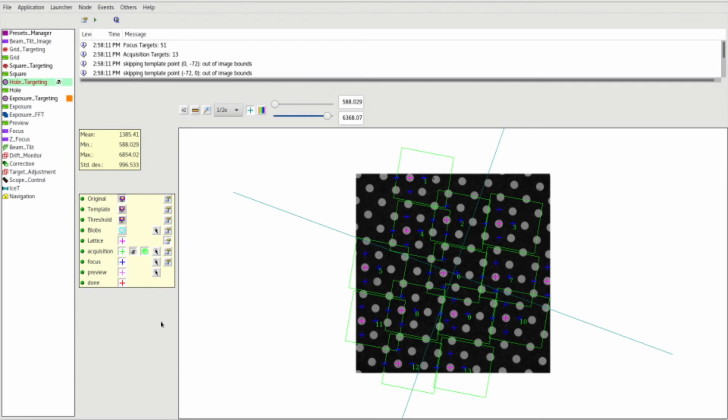To manually target, you can remove all of the targets. Select acquisition and place your acquisitions where you desire. Be sure to place the focus target equidistant from all of the targets that you made. Press play to submit targets and submit queue.